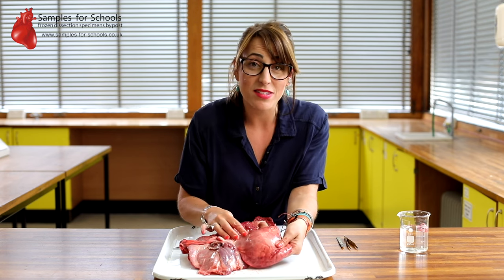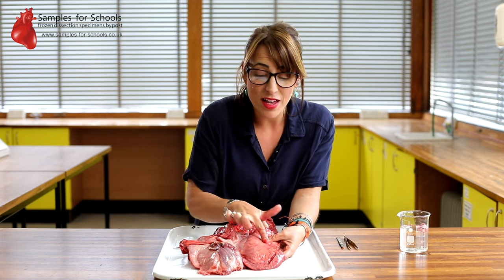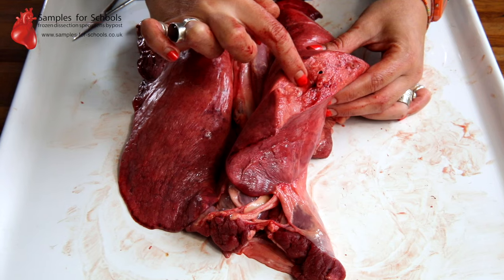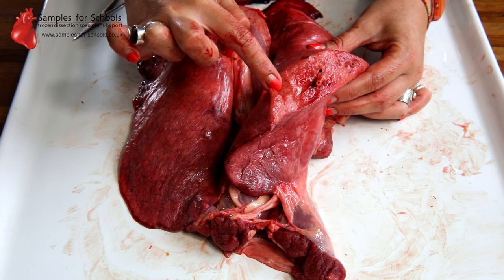The third thing that makes it efficient gas exchange is the ventilation of the lungs itself. That network of bronchioles means that oxygen gets to every aspect of that lung, so it's a large surface area.